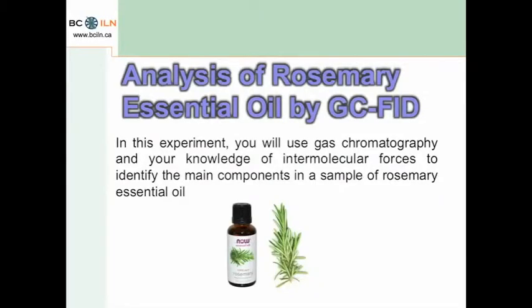Most people use or come across essential oils in everyday life. Have you ever wondered what these oils actually are? What makes them smell? What they're composed of? In this experiment, you will use gas chromatography to analyze a sample of rosemary essential oil.